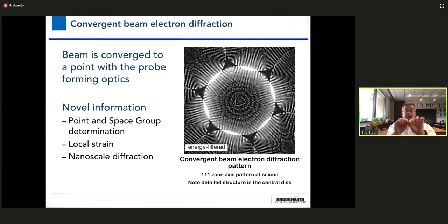now we actually have a thickness to that Ewald sphere because you have multiple valued K sub i's coming into the sample. The result of this is that, as you have a thickness, you begin to sample the three-dimensional diffraction space, the reciprocal space, and you see, first of all, beautiful patterns, but you also are able to capture the inherent symmetry of crystals.